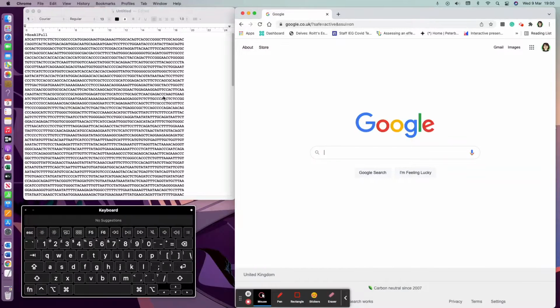Hello and welcome to the second tutorial on using bioinformatics tools in further education genetics teaching. In this video we're going to look at how to use a tool called ExPASy Translate, which is going to turn my nucleotide sequences into amino acid sequences.